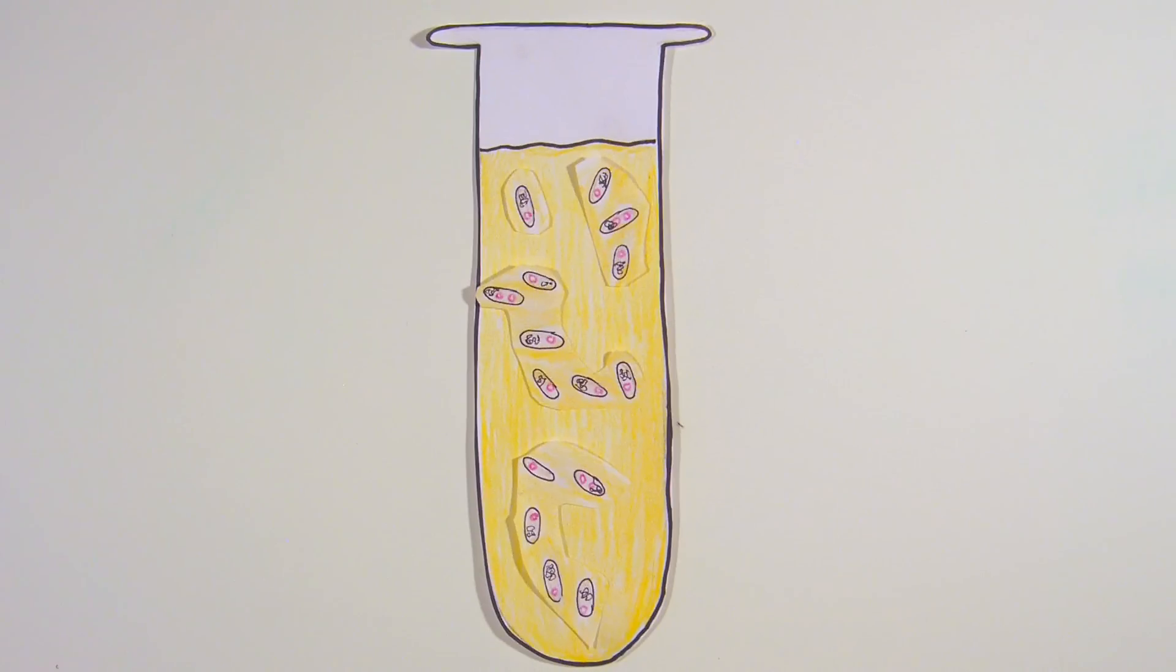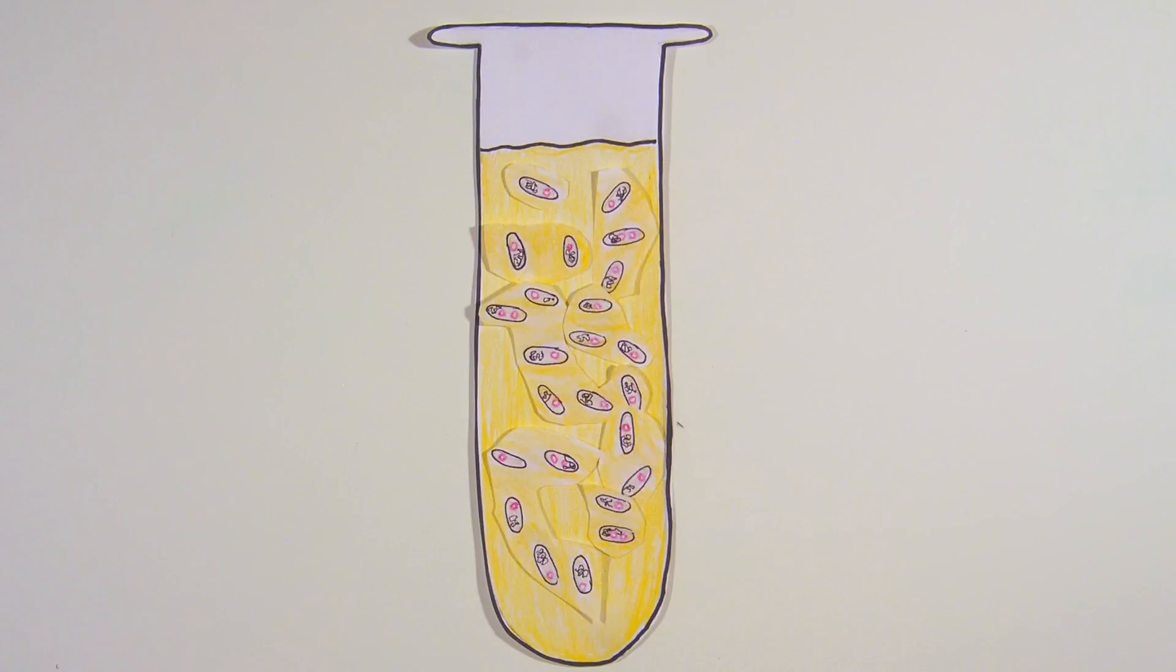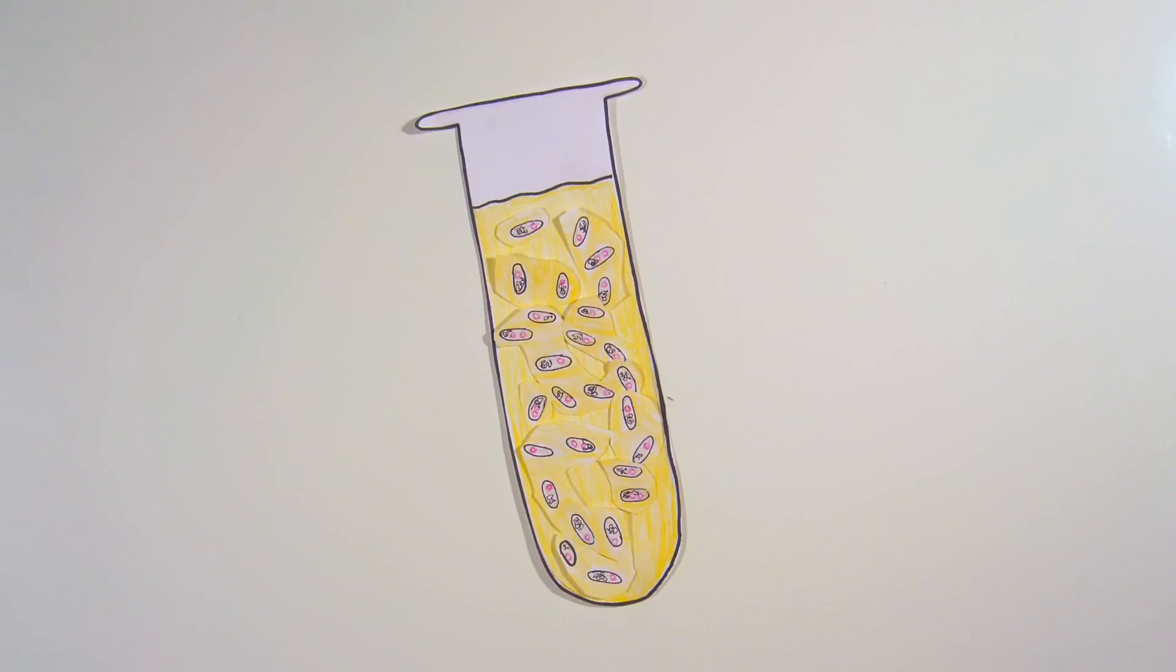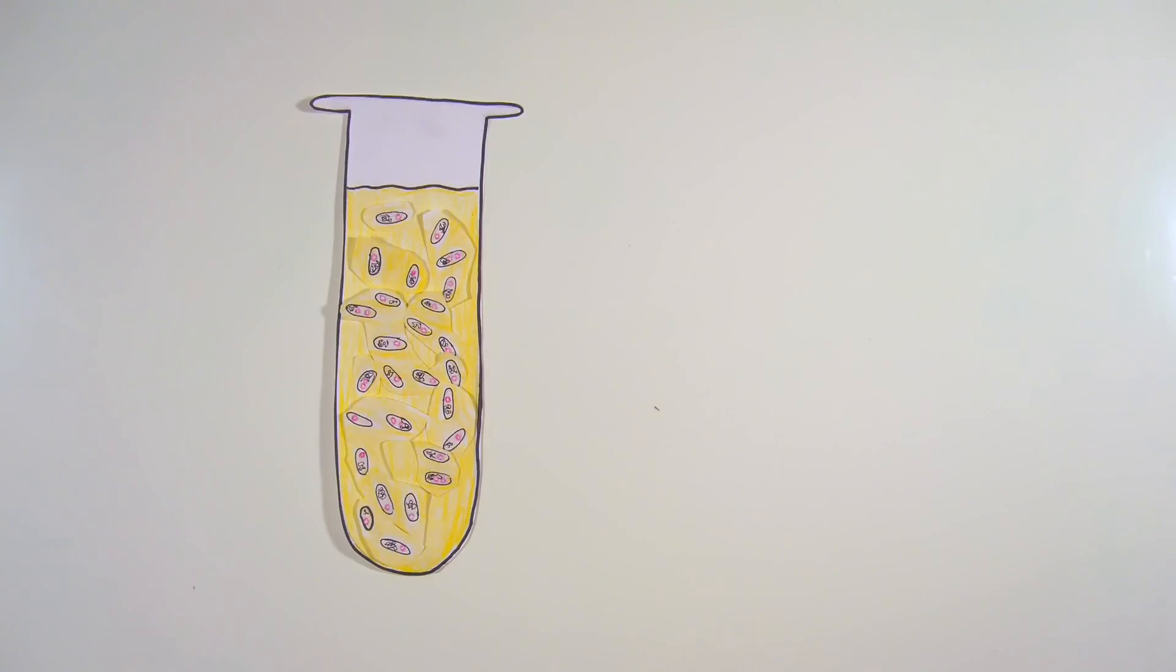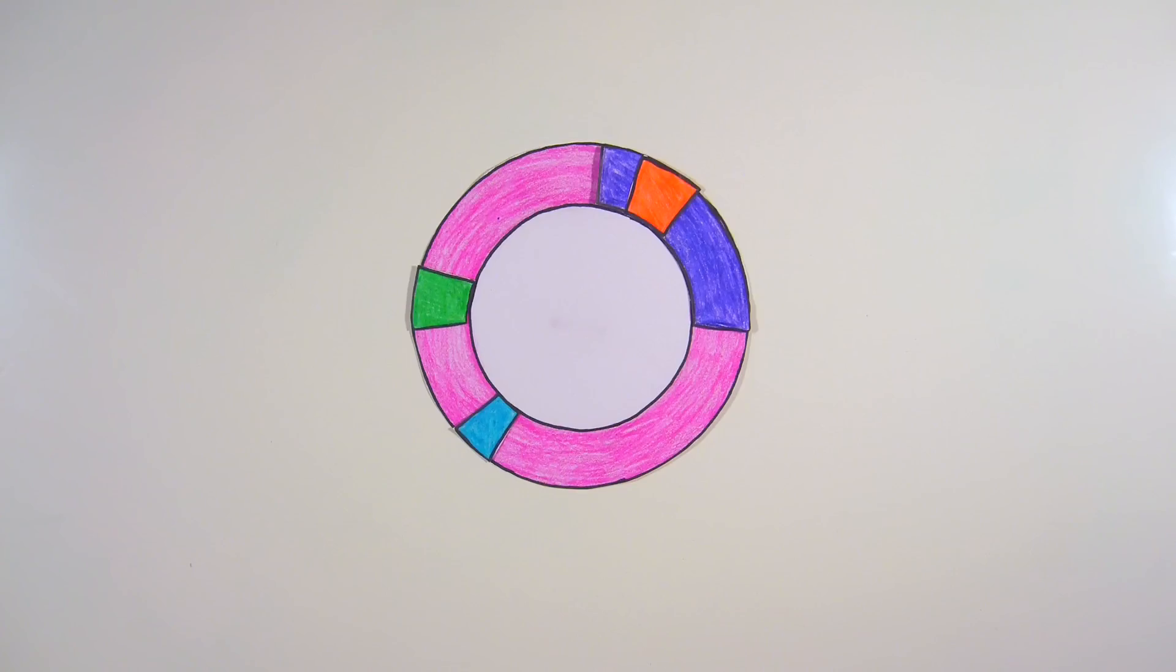Since bacteria replicate plasmid DNA before each cell division, and since some plasmids are present in several copies per cell, a simple overnight culture of bacteria can yield vast numbers of plasmid DNA molecules. For this reason, bacterial cells can serve as factories for making large amounts of plasmid DNA and the DNA sequence of interest.